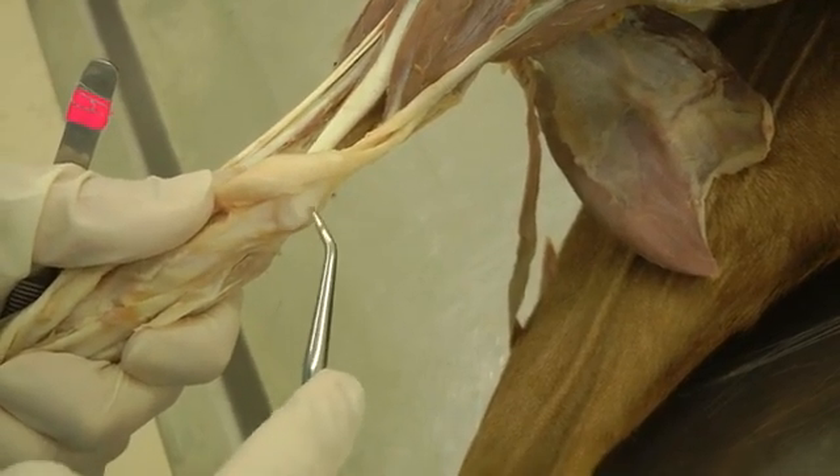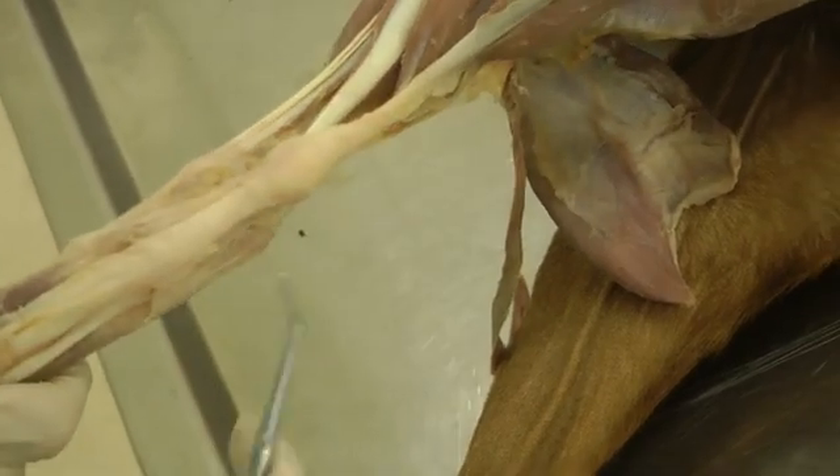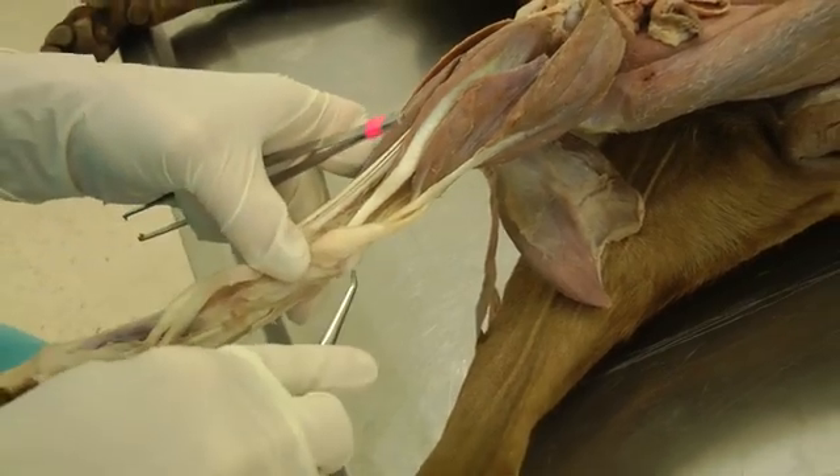There's that shininess underneath the tendon — that's the calcaneal bursa. You can go to either the lateral or medial side, just on either side of the superficial digital flexor tendon, peel it off, and you'll be able to see it.